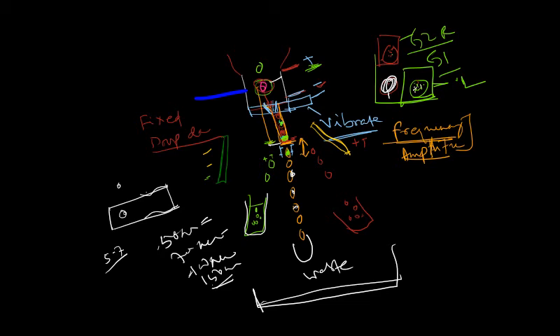So detection, decision, deflection, collection. This is how it is performed.